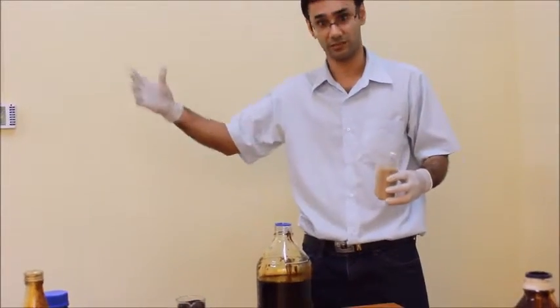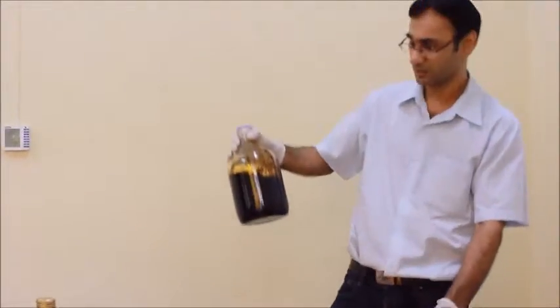And then we put it into a reactor that we call Pyrolysis Reactor. And then what happens? It got pyrolyzed. It becomes vapor and condensed. This is the liquid product that we got.